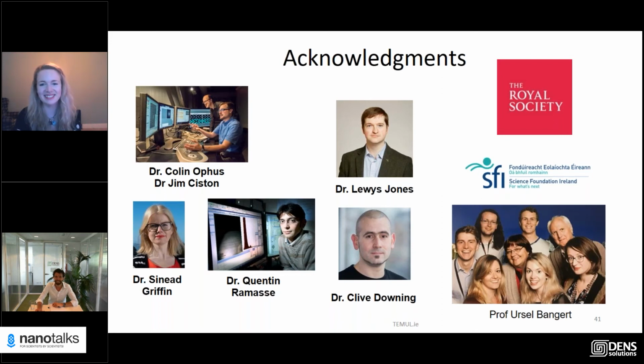Okay, thank you. So the next question is from Oana Andrea. First of all, thank you for a very nice talk. Can you please tell me if you had any challenges in reaching atomic resolution when the sample was under voltage bias? And also, what is the ideal thickness of the FIB lamella for biasing experiments?